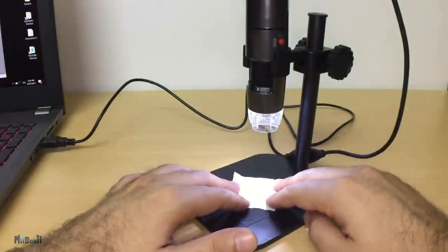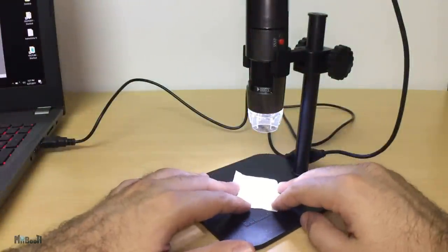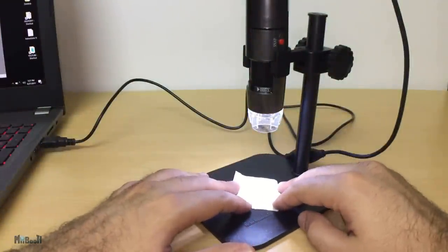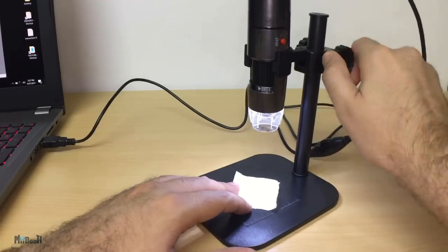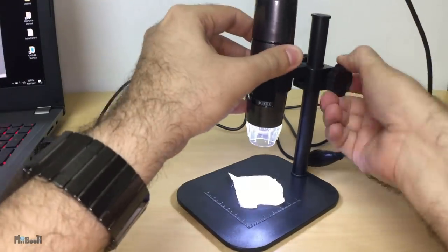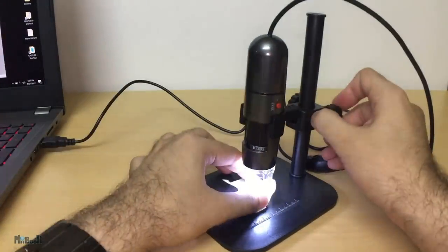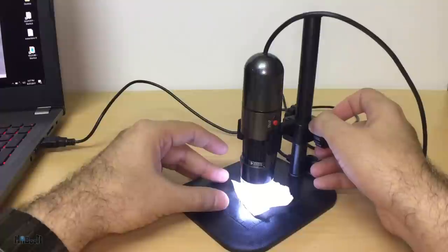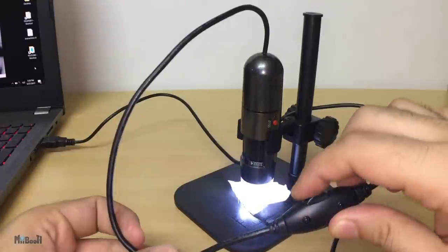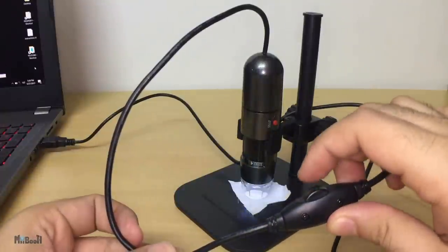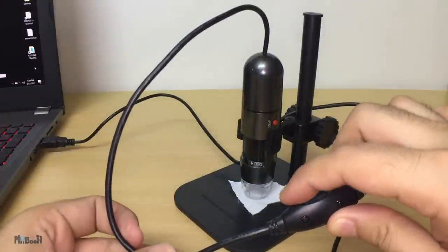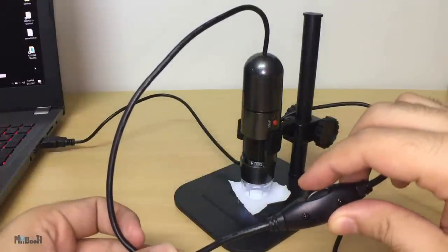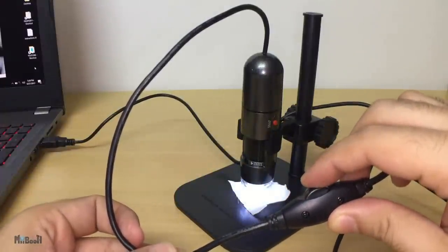Now all you have to do is slide an object under the microscope and turn the roller to zoom into focus. You can lower or raise the device by rotating these wheel kinds of things on the stand, and you can also adjust the lighting by this knob halfway down the USB cord.